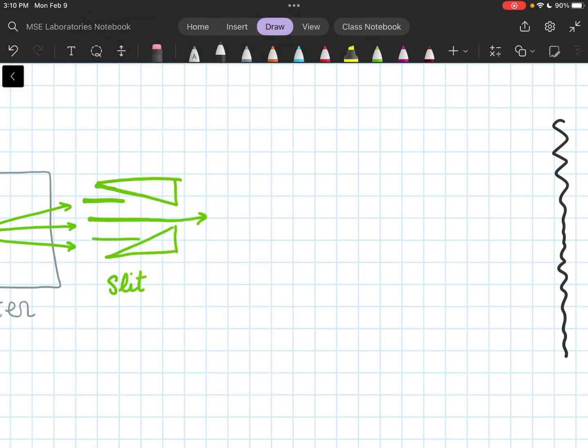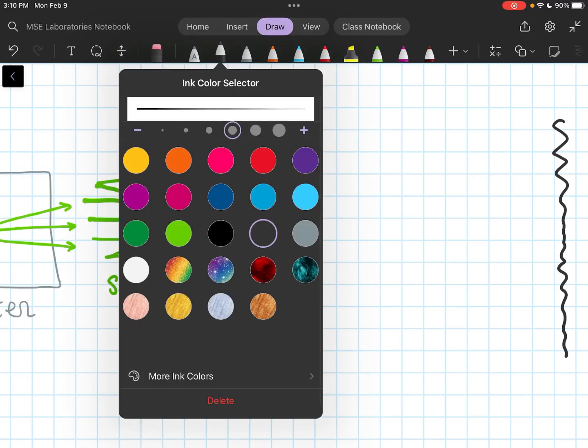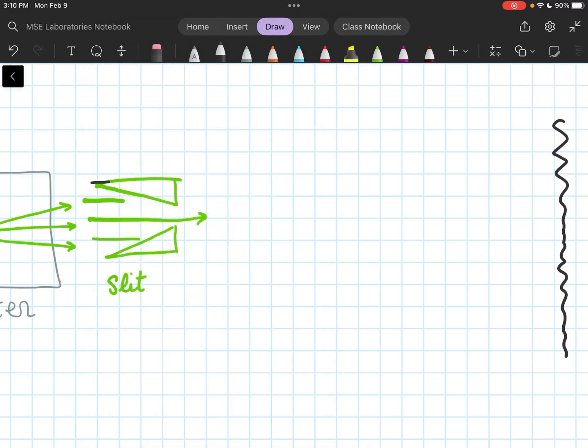Then the next section of things is going to be a lot of black box kind of stuff, because I don't know how every piece of it works, but I'm going to give you the name of it so that if at any point you're a grad student and you feel like you need to know how this piece of the instrument works exactly, you can go look it up yourself.